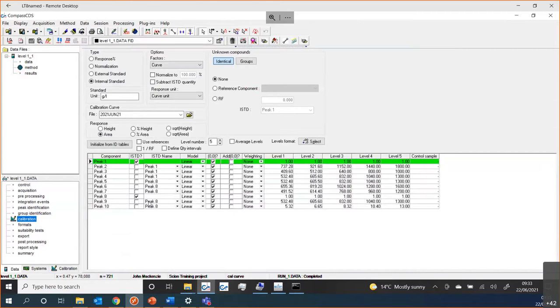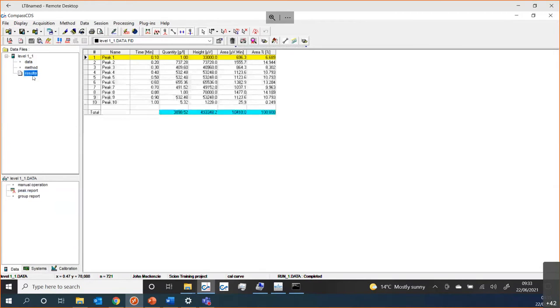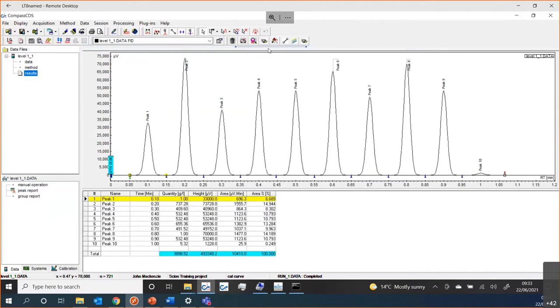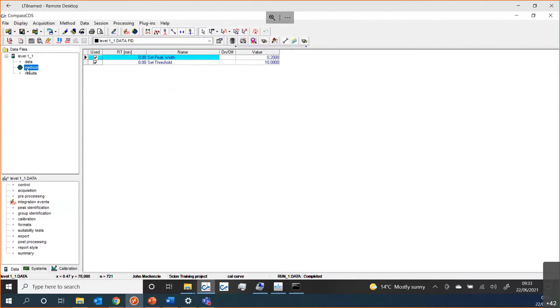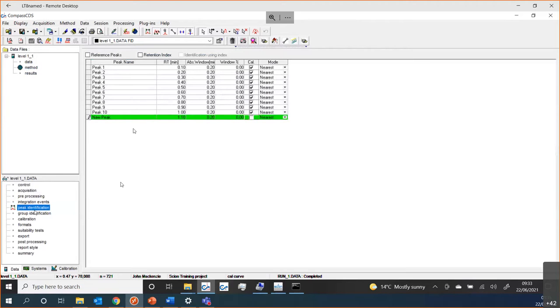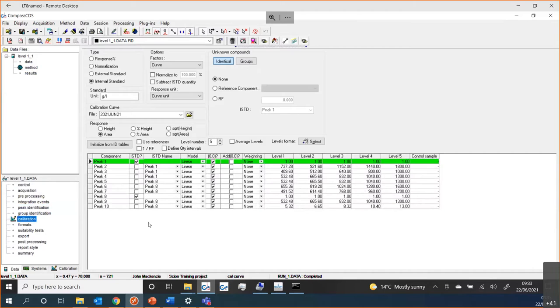And that works in quite a few places. If I go to my results screen, you can see that it is missing my chromatogram. I can just press that button to get it back again — quite a handy little feature that lets you control what's going on. So we have our peaks, we have our calibration data. I have already populated these so that we can create a calibration curve today.